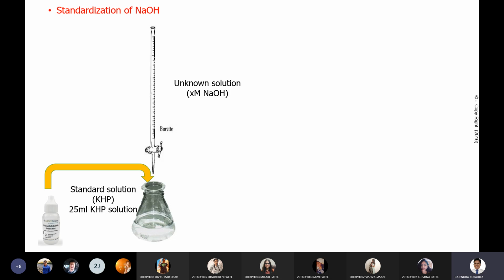કે NaOH નાખશો એ જેટલું બી KHP છે 25 ml KHP જેટલું બી છે, જેટલું બી સ્ટ્રેન્થ વાળું KHP છે, if suppose whatever KHP solution we have એ બધું જ suppose neutralize થઈ ગયું, પણ એ આપણને ખબર નહીં પડે આમાં, એટલે આપણે તો NaOH નાખતા જ રહીશું. પણ એક એવો ટાઈમ આવશે કે જ્યારે આ જે સોલ્યુશન છે એનો કલર ચેન્જ થઈ જશે ફ્રોમ કલરલેસ ટુ પિંક. સો એ કલર ચેન્જ ક્યાંથી આવ્યો?